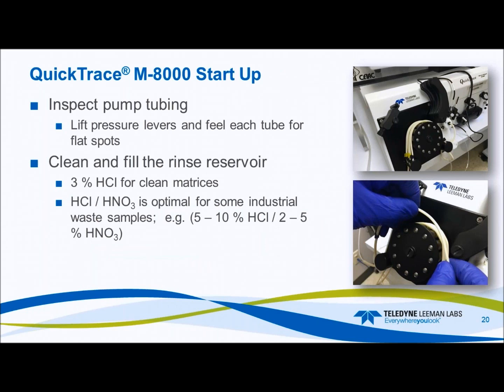So every time you start the system up, you want to inspect the pump tubing. So I lift the pressure levers, and I feel each tube for flat spots. The next thing you want to do is clean and fill the rinse reservoir. This is very important to keep for the shutdown process as well.